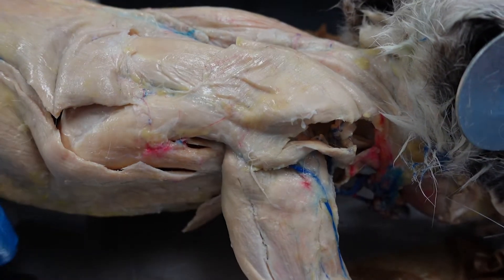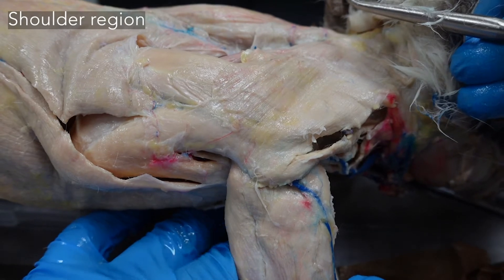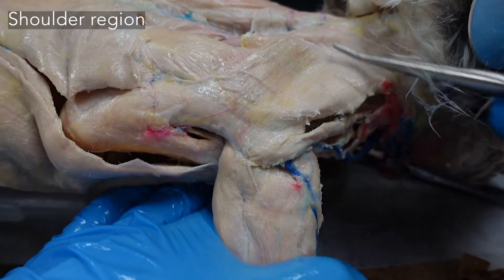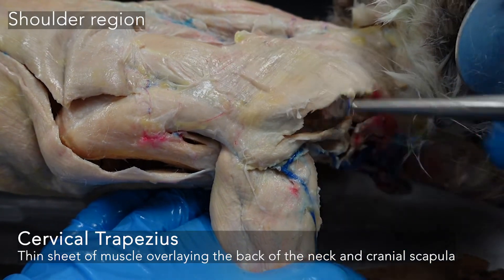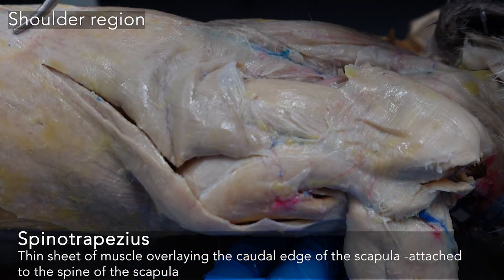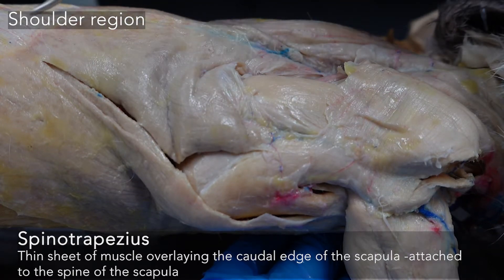Looking at the muscles of the shoulder and arm, you may have to stretch out your neck and arm just to get some tension in these muscles and more easily separate them. We have our cervical trapezius and our spinotrapezius. This muscle stretches all the way back here — it's kind of a wing from the spine of the scapula across the back.